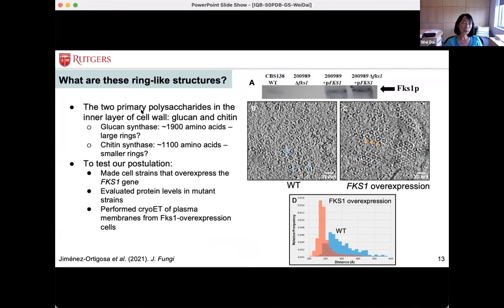So what are they? We know in the inner fungal cell wall layer, the two most abundant structures are chitin and glucan. Chitin synthase has a smaller molecular weight compared to glucan synthase. We also know glucan is more abundant than chitin. The most dominant structure in our tomograms are the large ring-like structures with a diameter of 170 angstroms. So we think, based on those observations, maybe the large ring is the glucan synthase and the smaller rings are probably chitin synthase.